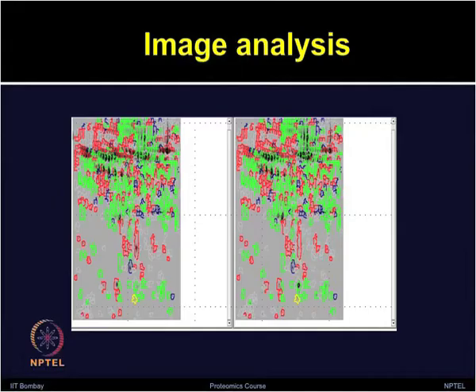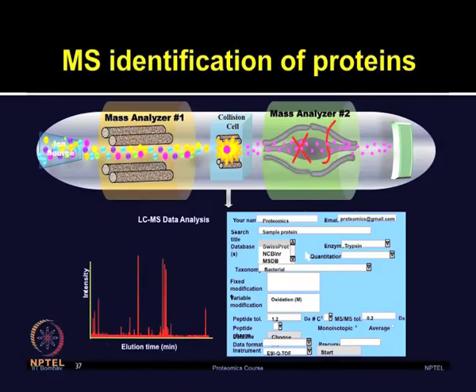So, the different levels of analysis were performed, which we have talked about earlier, but this just shows you the final output: 63 spots after all the analysis steps were considered significant. After 2D DIGE gel image analysis, authors excised those spots and subjected them to mass spectrometry for identification of proteins.